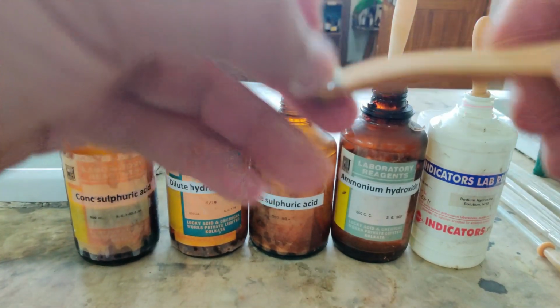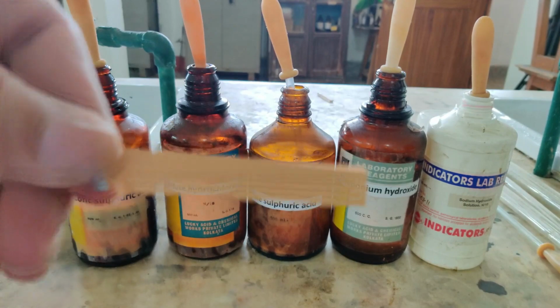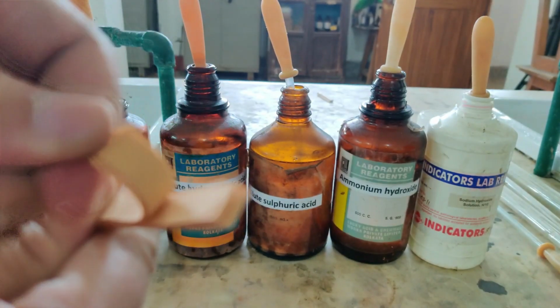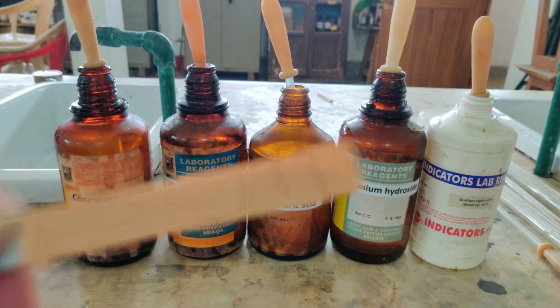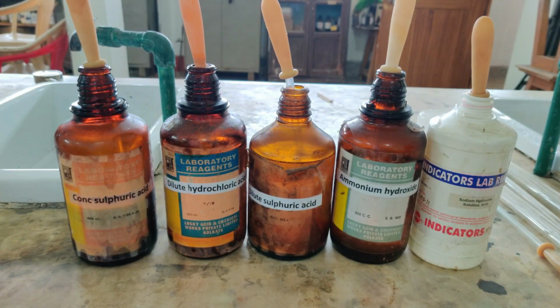Now it has many strips. Last time when I was teaching you theory, I was telling you about this strip. By the way, it is neither red litmus nor blue litmus. It is your universal indicator, containing many strips of paper. By looking at the color change of this paper, you should find out what the pH value is. It will take a little time to dry up, but let me tell you how to compare the pH.